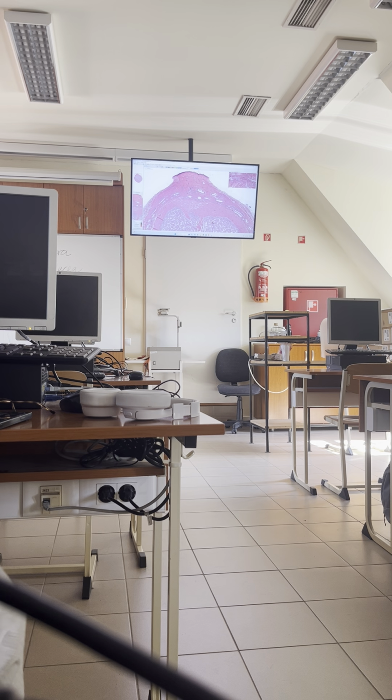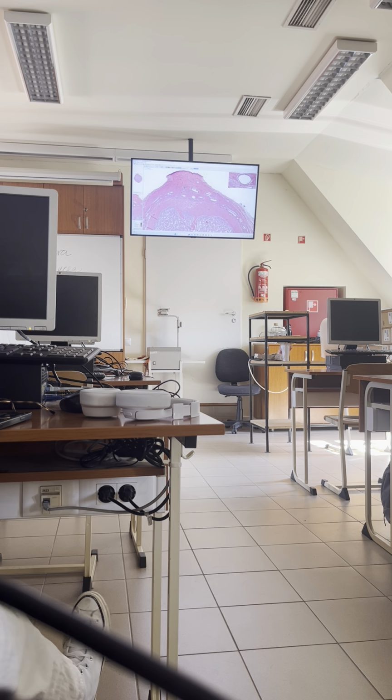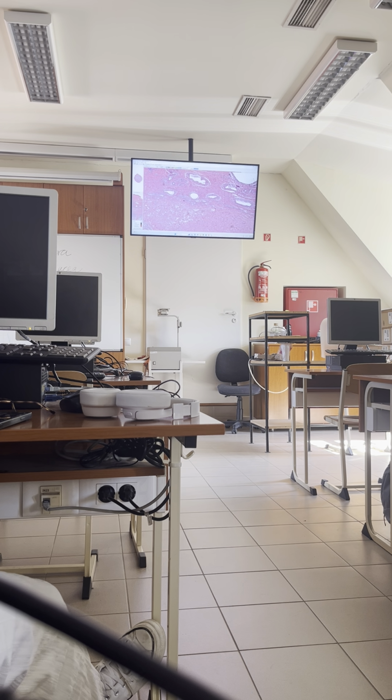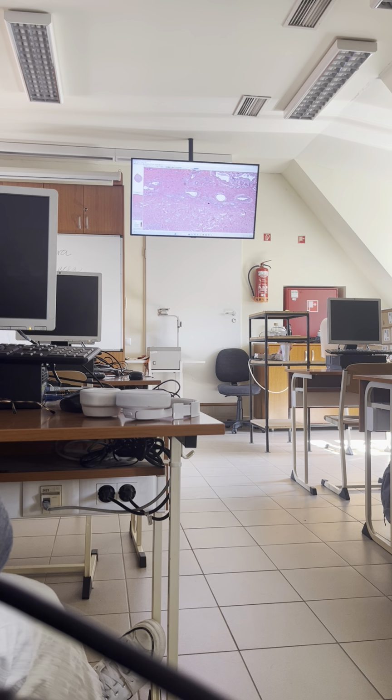One more thing here, dorsally, a piece of the skin remained, and also here you can see the arrangement of certain vessels. It's a rather unusual arrangement. Here is the dorsal vein in the midline, and on the sides there are two dorsal arteries. And even more laterally, here there are dorsal nerves, nerve fibers.